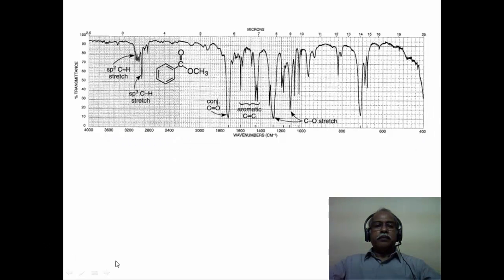This is a very characteristic infrared spectrum, for example. Here the wave number, which is an energy scale, is plotted against percentage transmittance. This is a convention that is normally used in infrared spectral plotting. One plots the wave number, and not the wavelength or the frequency, and one always plots the percentage transmittance rather than absorbance. One can plot absorbance if you want to measure in quantitative terms.